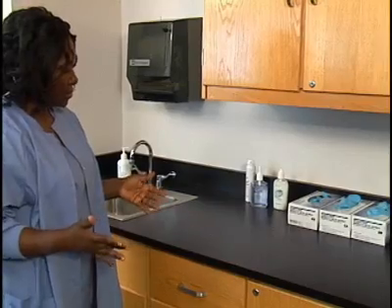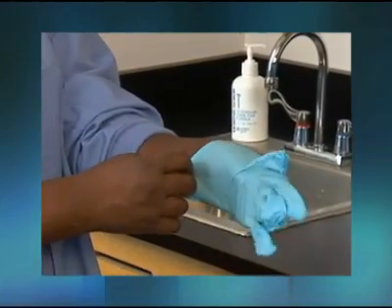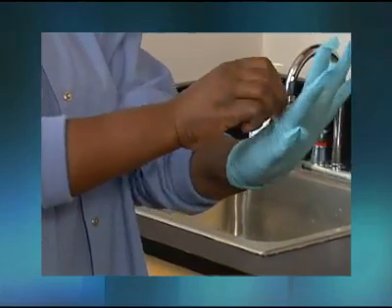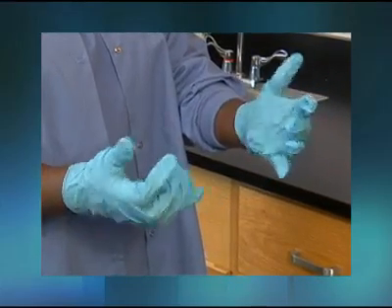Choose the correct sized glove for your hands. Your gloves should fit snugly, but not be too tight. If your gloves are too small, they may rip as you are applying them or become uncomfortable to wear. If they are too large, you may find it difficult to perform your tasks.